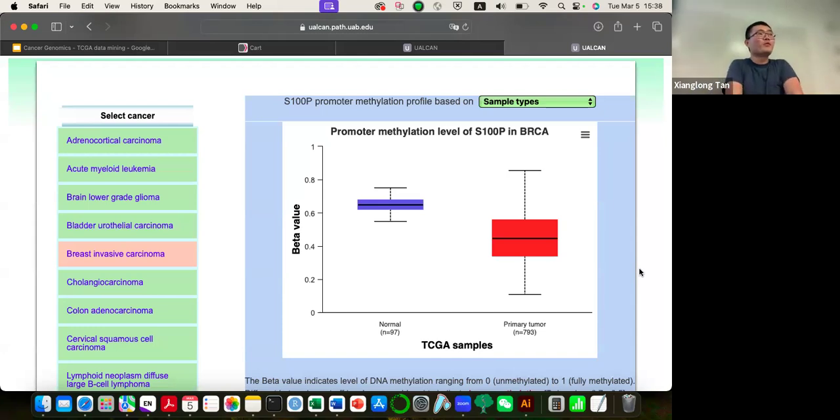Okay, today's workshop went really smoothly. We didn't have major difficulty using the Linux command line. And tomorrow we'll be using the TCGAbiolinks package to learn how to query, retrieve, and load this data into our local computer, and then do some downstream data analysis.